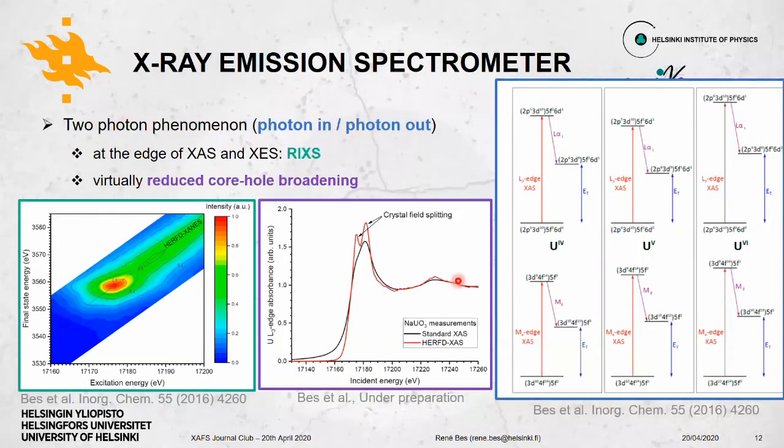All right. Someone commented that SSRL 10-2 has optimized their beamline for rad materials. One more question: whether M-line emission for detection helps with overabsorption by reducing the probe depth. Matthew, do you want to ask that question? I may not be phrasing it properly. Are you available? Yeah, here I am.